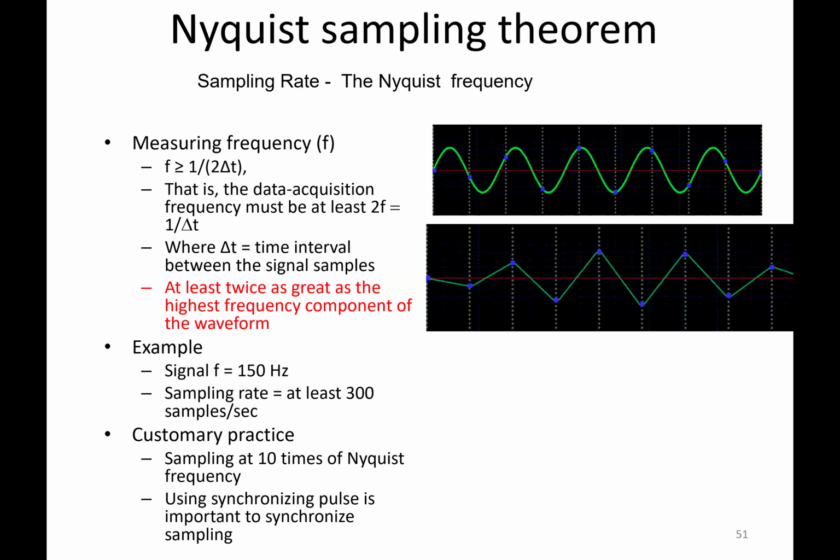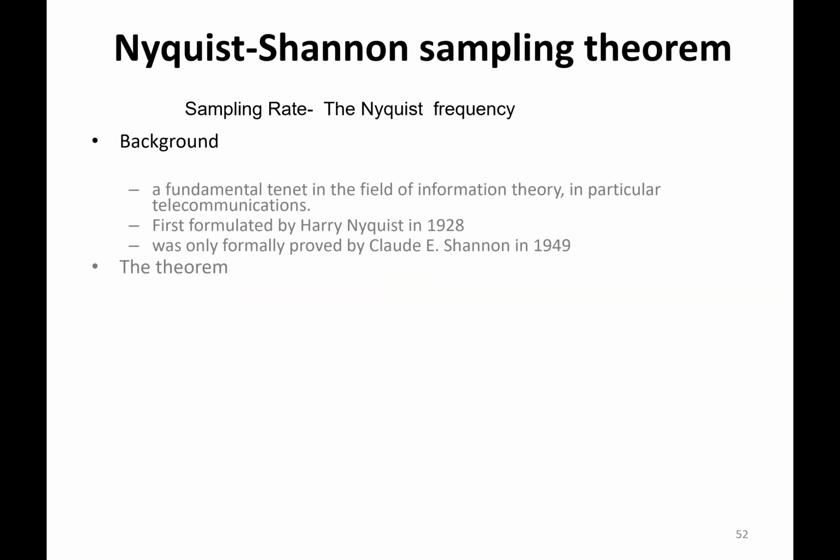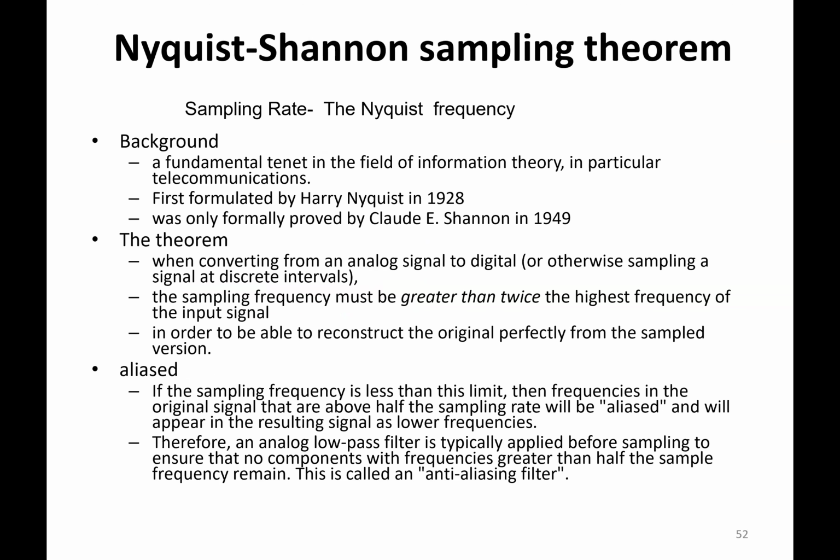Okay. So the consequence of this is the same kind of thing on this theorem. If you don't sample at least twice the frequency that you want to acquire, then there is aliasing. This is very common in infrared spectroscopy, and if you don't do that, you will see peaks that fold over, and you don't know how to interpret that data.